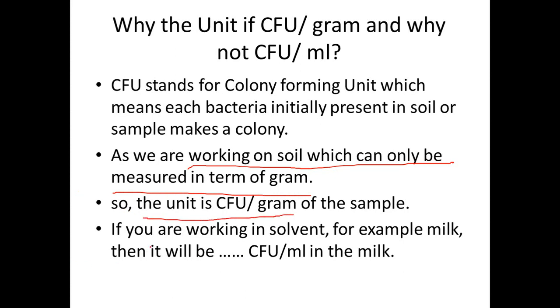But if you are working with a liquid, suppose you are finding the number of microorganisms in milk, milk is measured in ml, not in gram. So you have to write CFU per ml. In the case of a solid, you write CFU per gram; in the case of milk, you write CFU per ml. So this is about the serial dilution technique and its calculations.